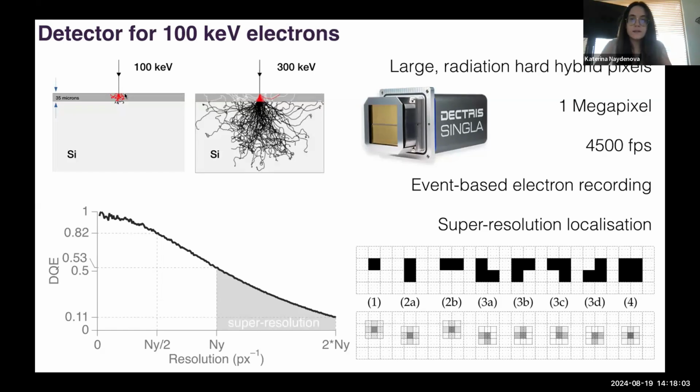So then the design of the detector becomes slightly different. You don't have to make the detector layer so thin, and you commit to detecting the entirety of these trajectories. Instead, you also have to make the pixel laterally wider, so you can allow for this spreading of the electron trajectories.